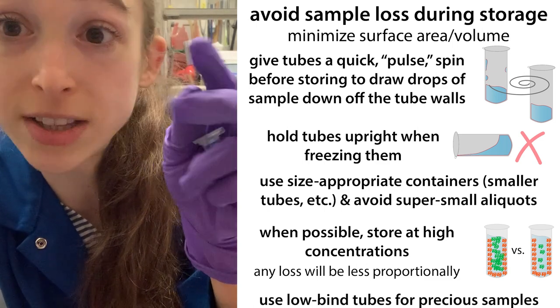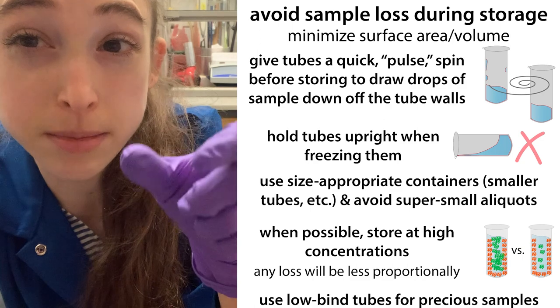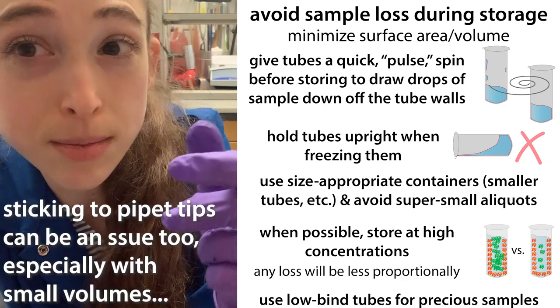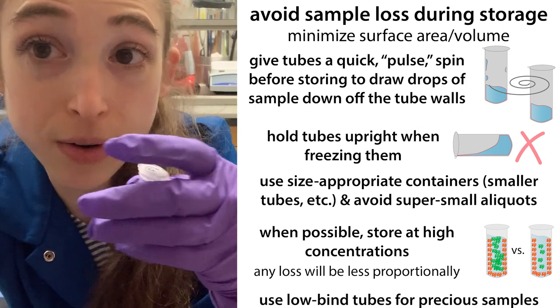It's great to store aliquots as single-use servings so you don't have to freeze-thaw things many times. But if your aliquots are too small, not only is the pipetting potentially unreliable, but you're also going to have some loss due to sticking and due to evaporation. So try to avoid really tiny volumes for your aliquots.